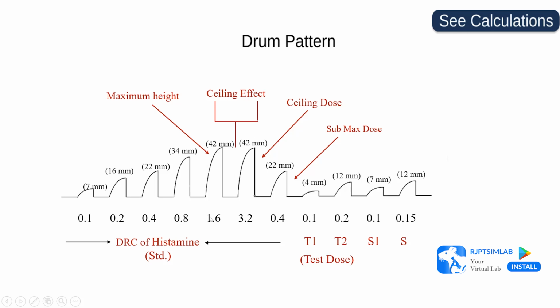And for confirming, again we have placed another concentration, a 3.2 ml concentration, and it has shown the same height, 42 millimeter. And this is known as the ceiling effect.